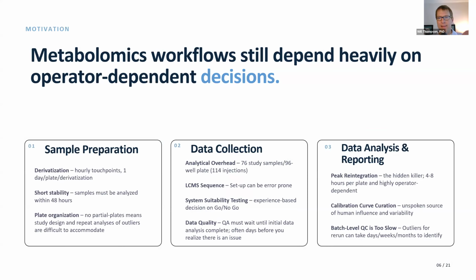If we take a step back, these are not the only issues with metabolomics, especially with bile acids analysis. We expand the landscape from bile acids out to larger metabolomics workflows. There are a tremendous number of operator-dependent workflows and, frankly, decisions that need to be made. Some examples are shown here, and Dr. Chidley is going to share some of her own personal experience with some of these areas.